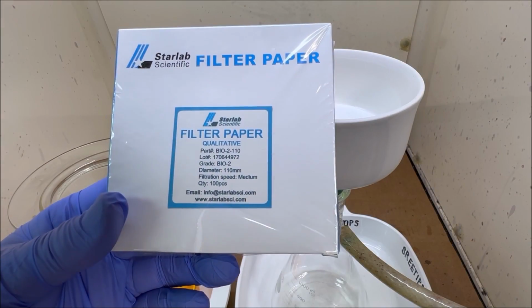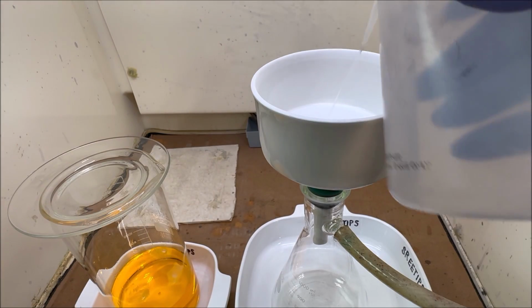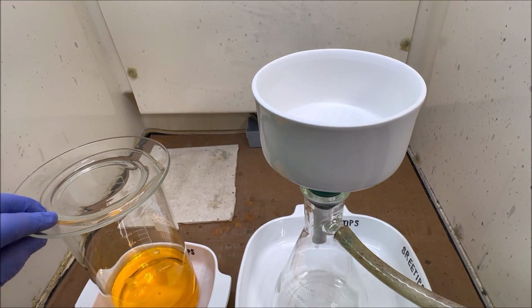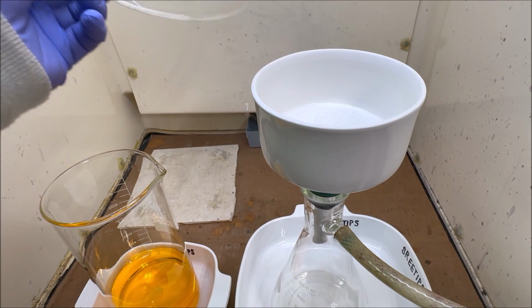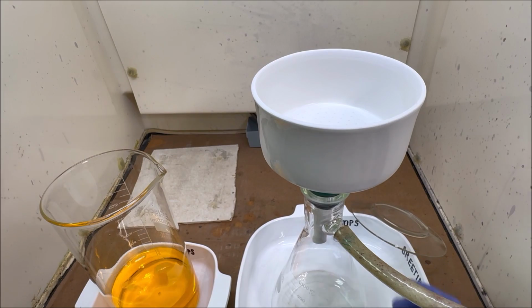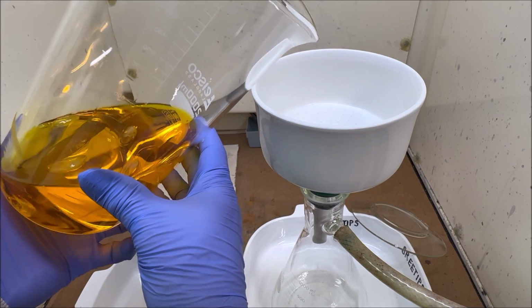Got a number 2 medium flow filter in our funnel. I'm gonna go ahead and wet it. Our solution is really looking just excellent here. Hardly any reason to filter it at all, but we're going to pour it through the filter.